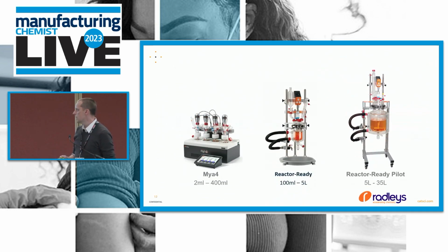So a powerful approach. We have various families of equipment at CatSci, and most recently we've centered around the Radleys family, and this lets us fully understand the mixing regimes and the vessel dimensions and what happens between scale from 2 mL all the way up to 35 litres, and we were able to predict what's going to happen across that whole range through that modelling.